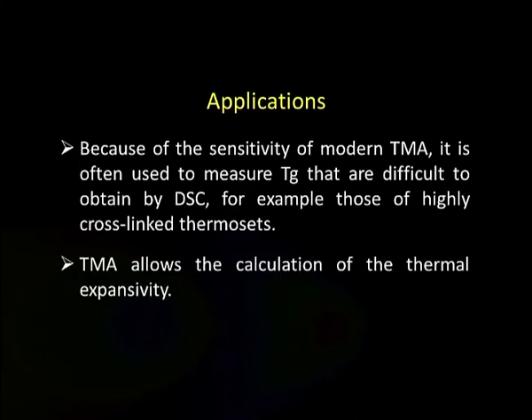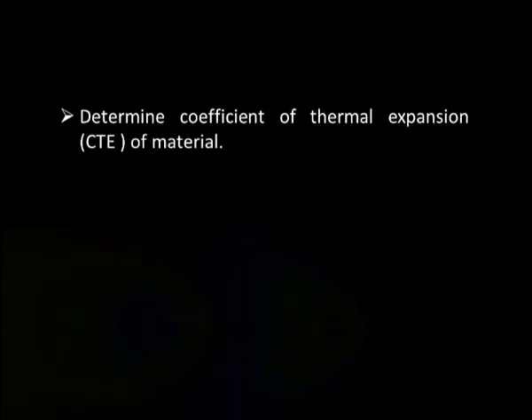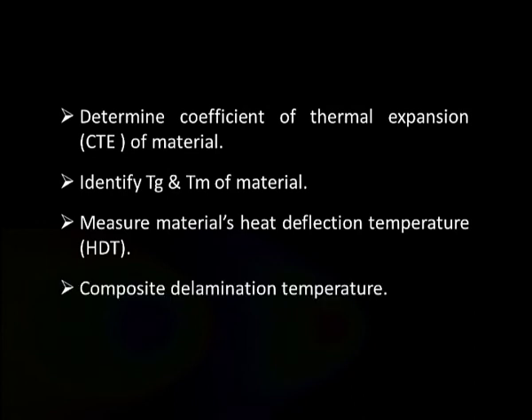TMA allows the calculation of the thermal expansivity. Determine coefficient of thermal expansion of material. Identify Tg and Tm of several materials. Measure materials heat deflection temperature known as HDT. It is used for composite delamination temperature.